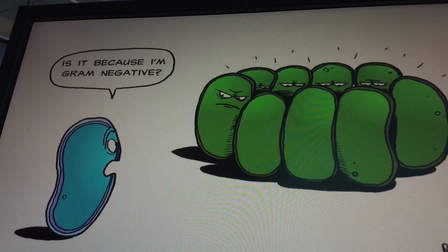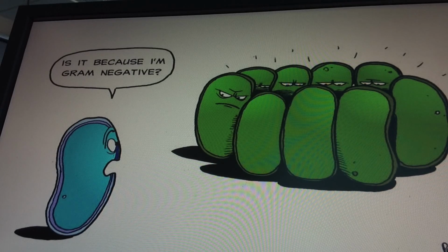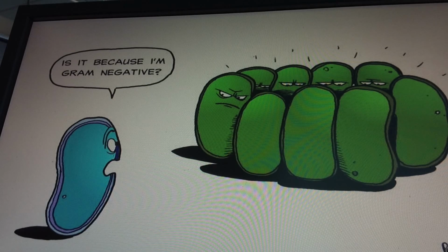We concluded our unknown bacteria as E. coli through several metabolic tests. We found that ciprofloxacin will be the best antibiotic to treat an E. coli infection. Old bleach is a good disinfectant against E. coli, and iodine would be a good antiseptic.